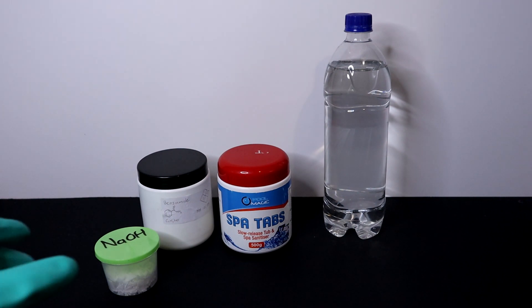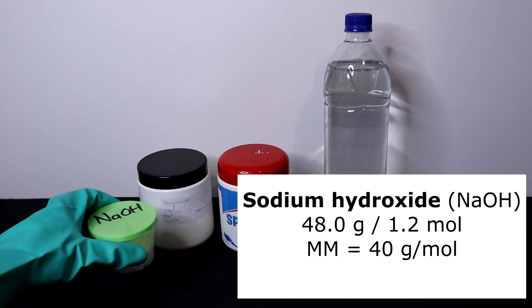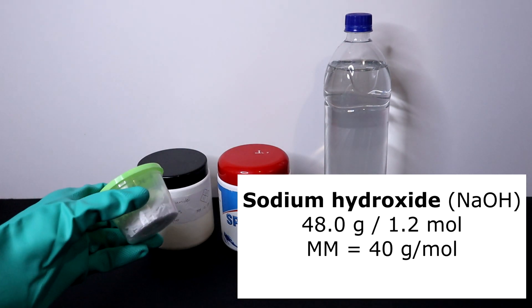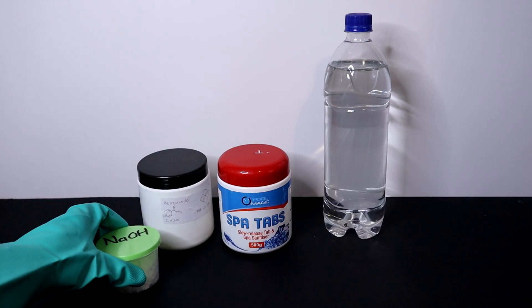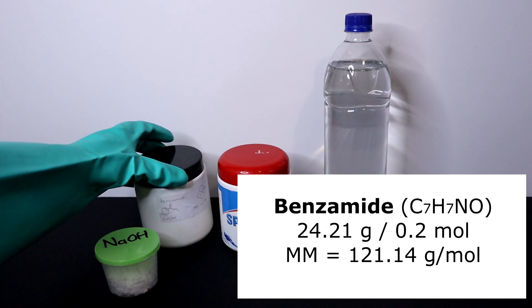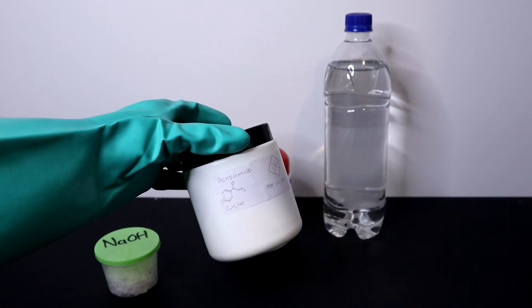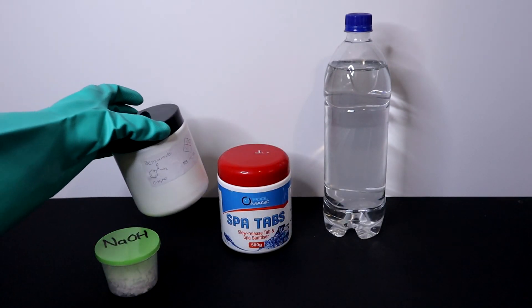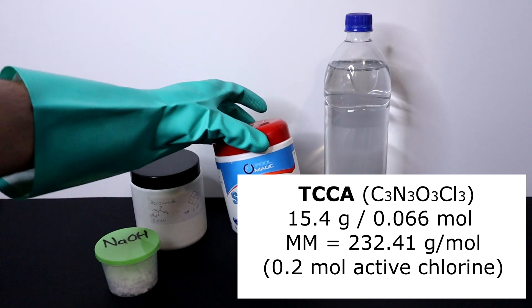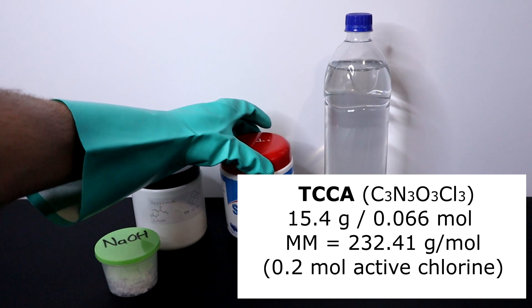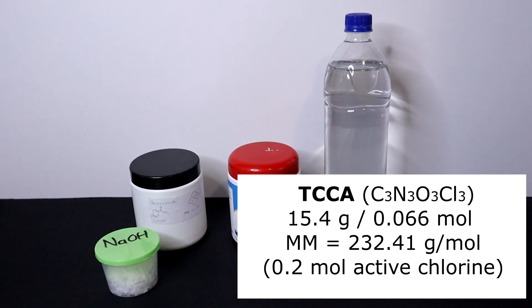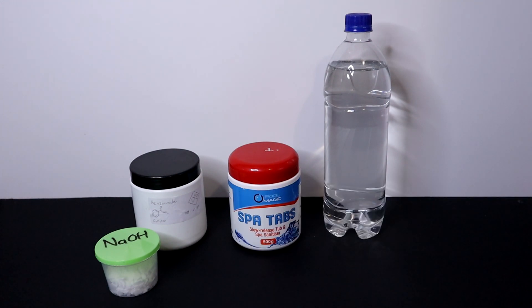In today's procedure I'll be using the following: 48 grams of sodium hydroxide representing 1.2 moles, 24.21 grams of benzamide or 0.2 mole, and 15.4 grams of trichloro isocyanuric acid or TCCA for short, equivalent to 0.066 mole. This will react to provide 0.2 moles of hypochlorite. Lastly some water and ice will also be needed.